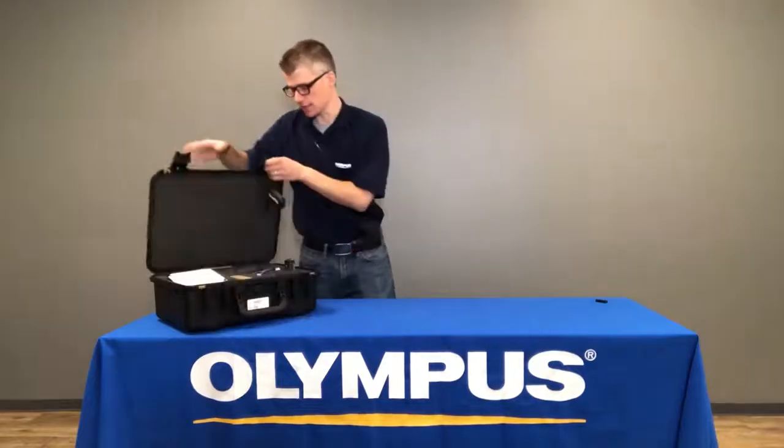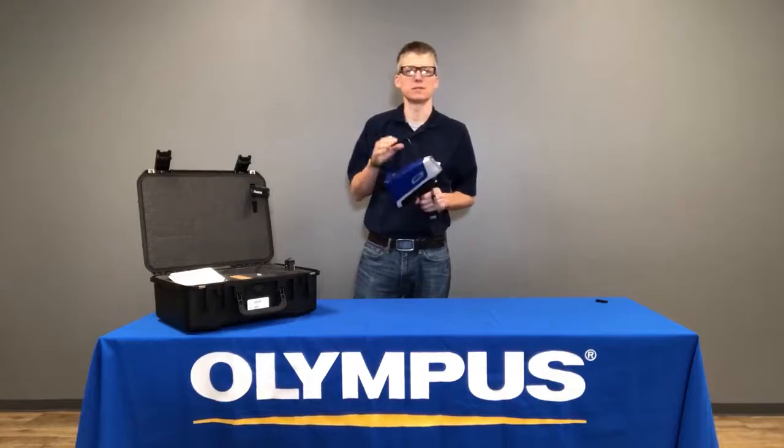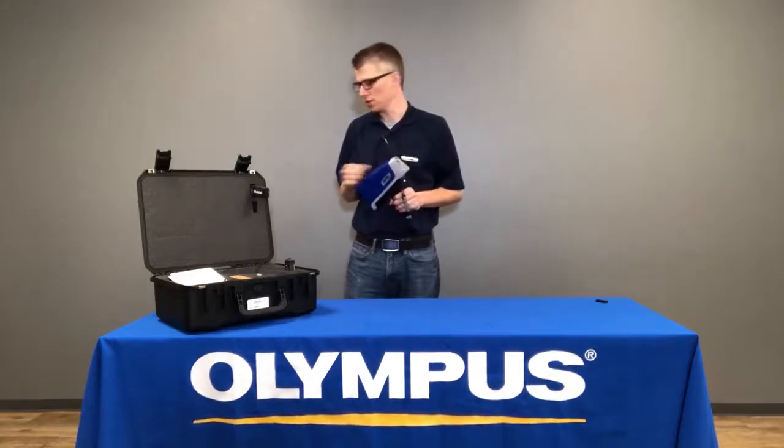When you open your case, the first thing you'll see is the Vanta itself. Depending upon which model of Vanta you purchase, the Vanta may be blue, orange, or yellow.